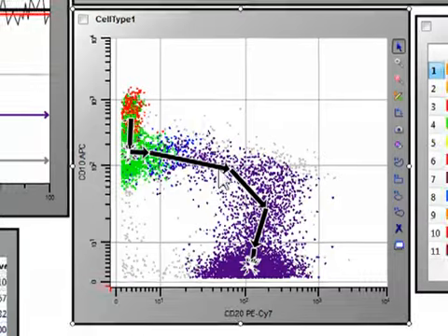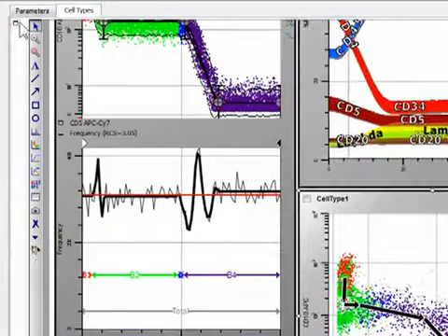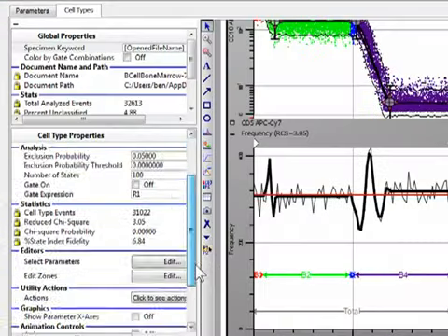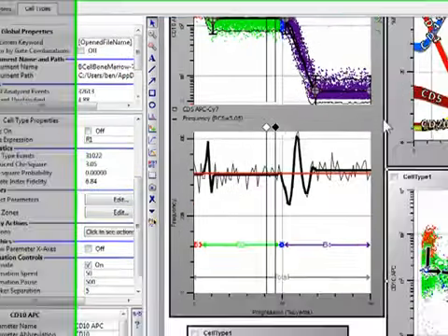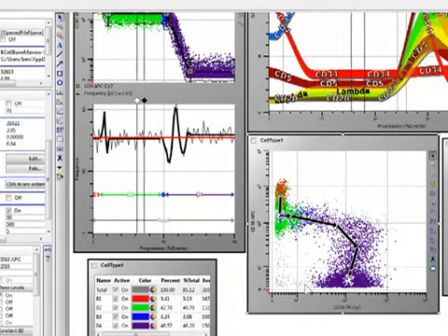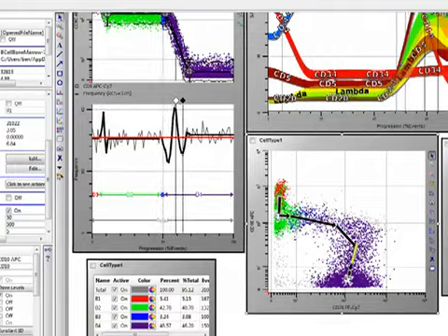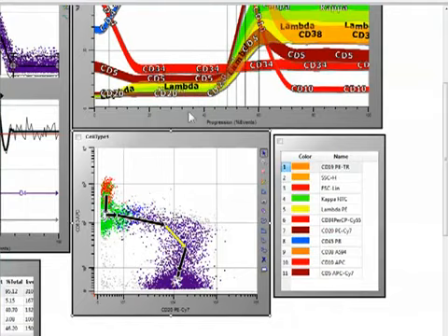We can add a little motion to it by turning on our animator, and we'll go ahead and do that now. So here you really can see the relationship between the model and the measurement space. I see. So what you're looking at is 11-dimensional space, and we're looking at B cells as they develop in bone marrow. And I think to answer Sam's question, I thought he did a great job.